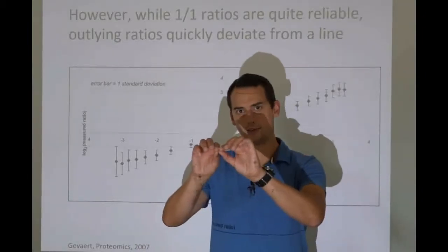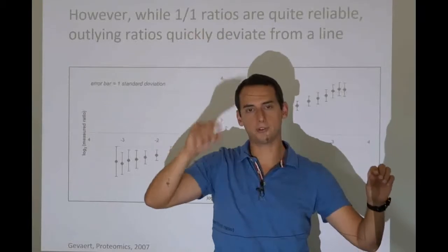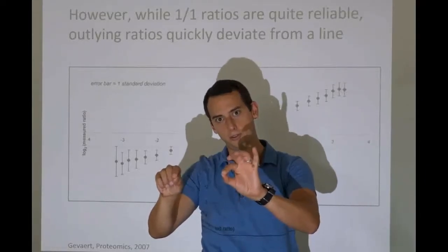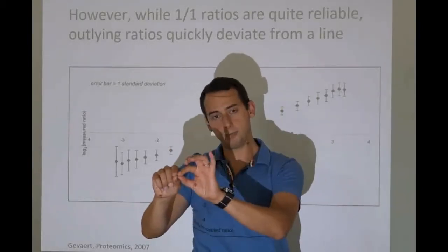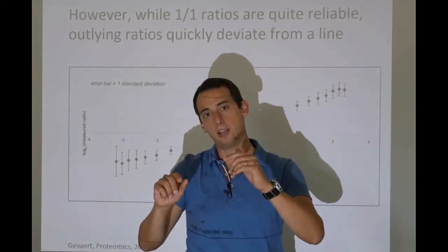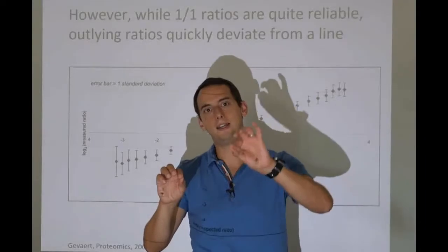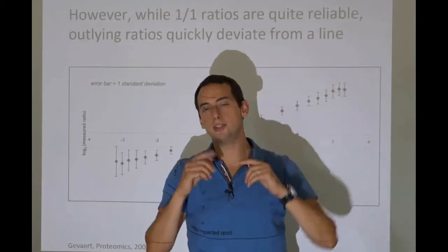So if this is the axis of the number of photons, and this is the axis of the response of your neurons in your brain, you can say that if the number of photons is too low, there will be no response. And it will remain so until you hit a certain threshold, from which point onwards your neurons will start to fire. And so it will be flat, and then it will start to go up. And for a little while, it will be such that if I put twice the number of photons in, your eyes are going to say, oh, this is twice as bright. And so you get what we call a linear response for a while. And then suddenly, your eyes will stop being able to see any differences.